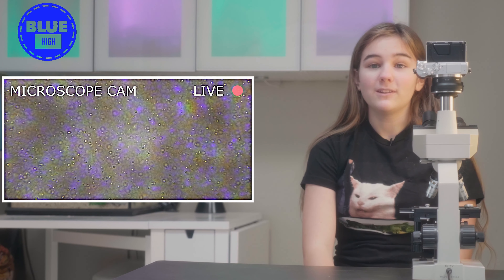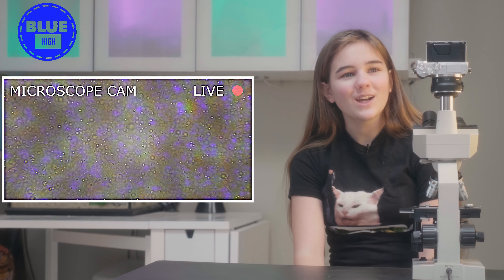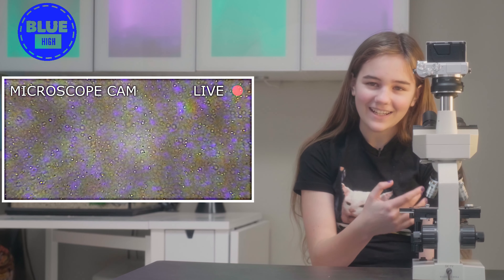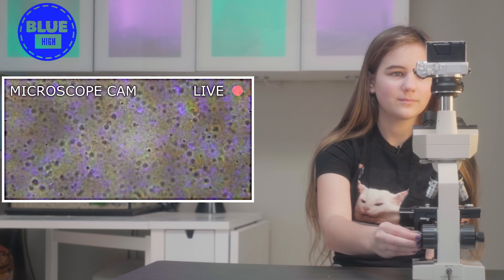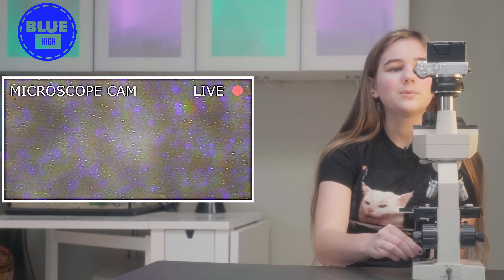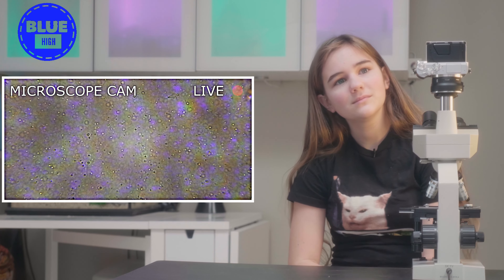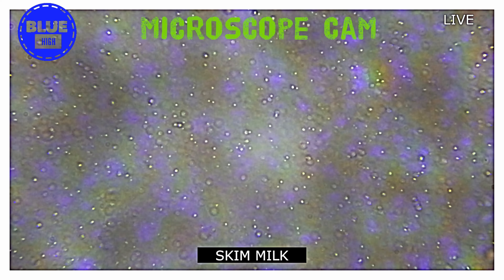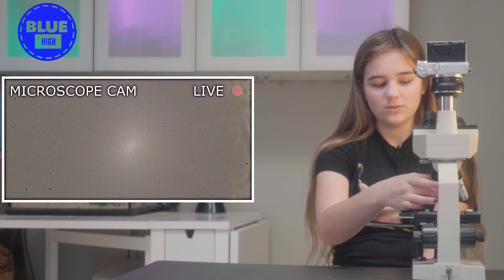If you're wondering what blue and green is in the background, it's because we have light so that we can see the stuff. It's because we have light and since milk is clear, we can see the light sort of. I'm just going to keep exploring, and if we don't find anything, then we are going to go to white. It looks fairly the same all the way through it. I think I'm going to lower the plate and go to white.